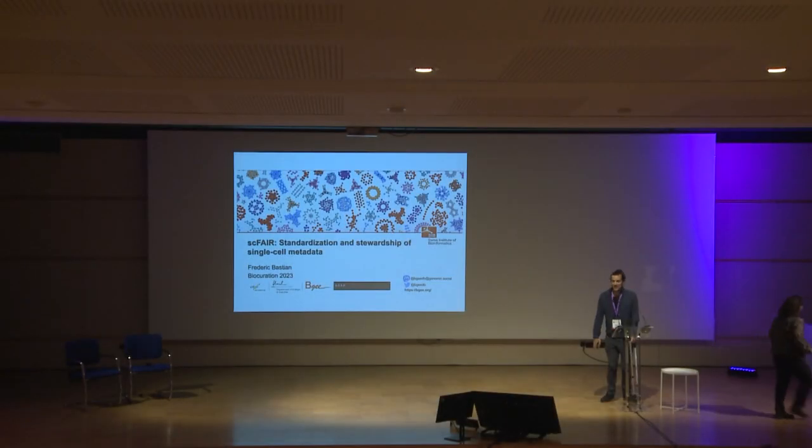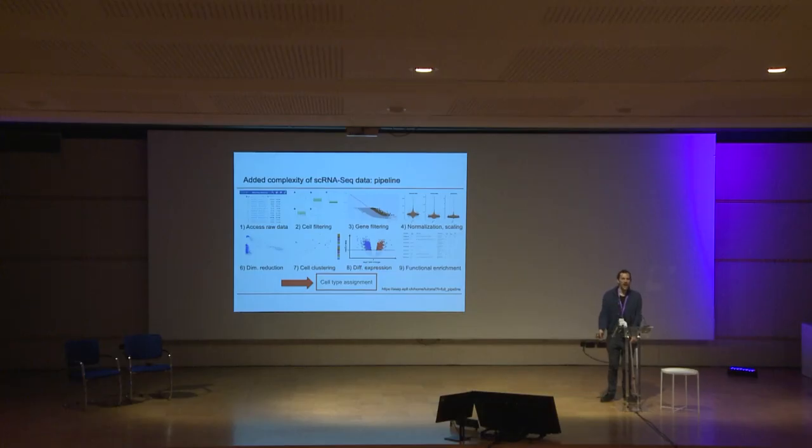Hello, so I'm here to speak about the project scFAIR, which is about standardizing and providing stewardship for single-cell metadata. As you are probably aware, managing single-cell data brings a whole new level of complexity compared to regular bulk data in the past.